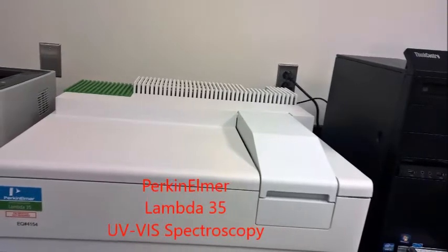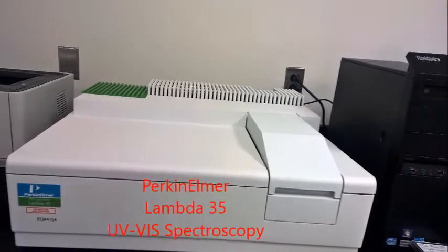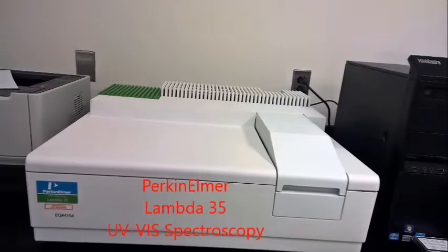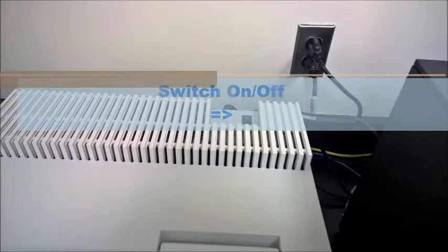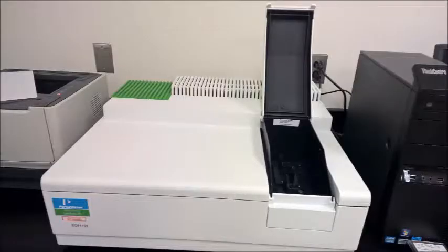This is a double beam UV visible spectrophotometer in the laboratory. The on and off switch of the instrument is located in the back. This is a Perkin Elmer Lambda 35 UV visible spectrophotometer.